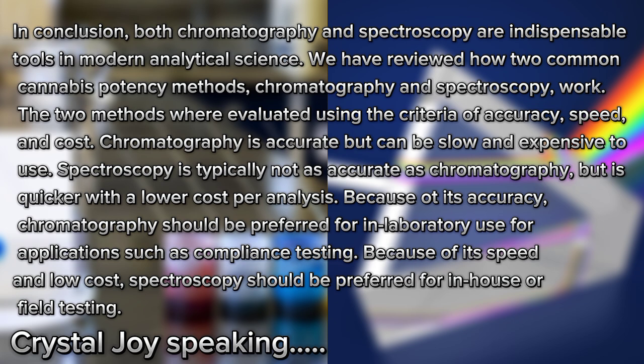Because of its accuracy, chromatography should be preferred for in-laboratory use for applications such as compliance testing. Because of its speed and low cost, spectroscopy should be preferred for in-house or field testing.